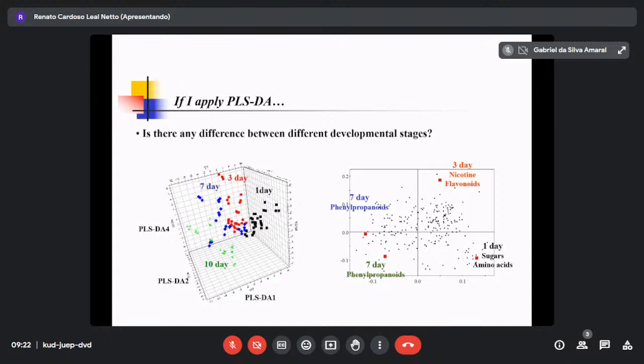Instead, if I give only one variable, age, then you put 1, 3, 7, 10, which means getting older, which metabolites are higher, getting younger, which metabolites are higher. Then you can get these cases. Do you understand? So even with numeric data, you have two kinds of choice. Would you treat them as text or as a number? In this case I treated them as text, which doesn't make any sense. Instead, naturally it is an age effect.